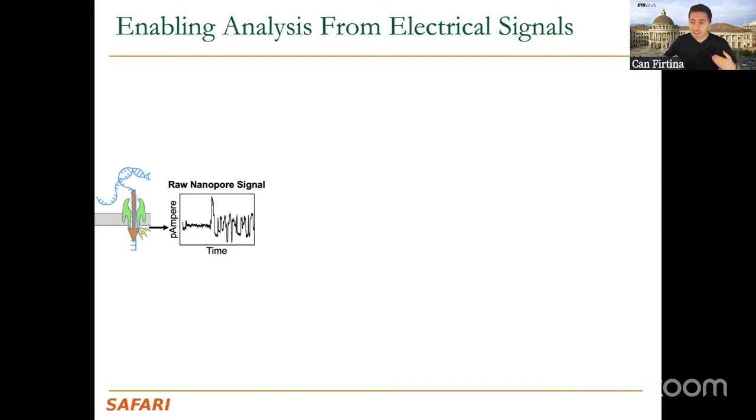So this is not simply the collection of the bases that you have in the nanopore, but their order is also important, because you can change the order. This means that the base closest to the sensing head will be different, and also the distance of the other bases to the sensing head will be different, so perhaps you will generate a different characteristic of the ionic current disruption.